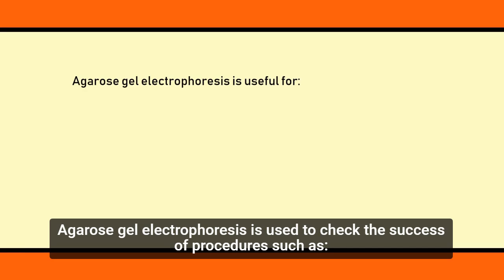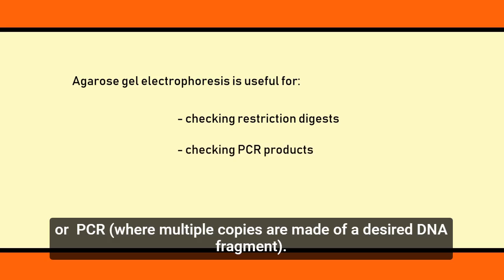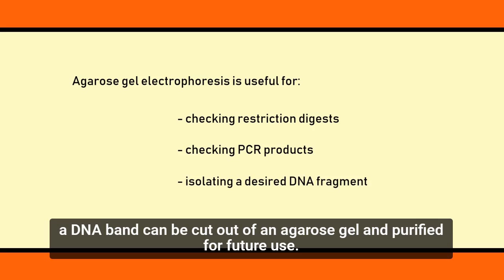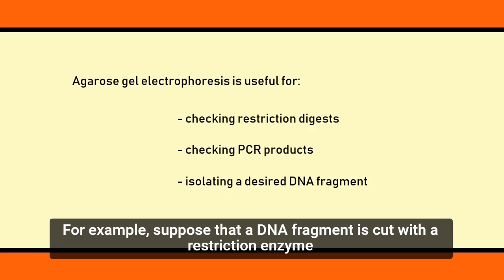Agarose gel electrophoresis is used to check the success of procedures such as restriction digests, where DNA is cut into specific fragments, and PCR, where multiple copies are made of a desired fragment. If a particular fragment is needed for further experiments, a DNA band can be cut out of an agarose gel and purified for further use. The number and size of bands can give us information about a DNA molecule.